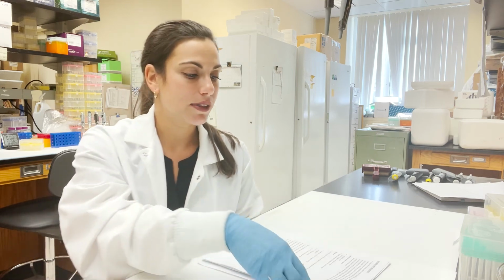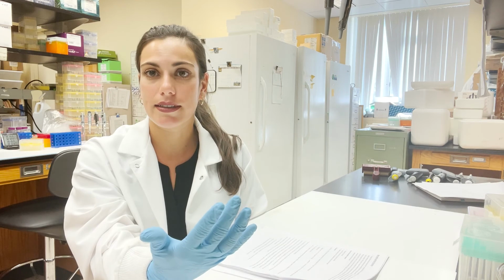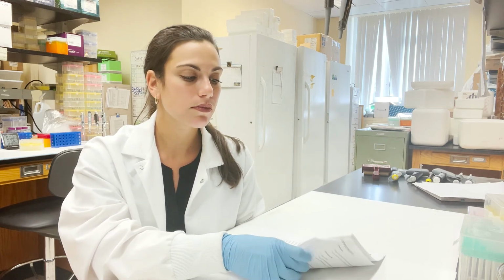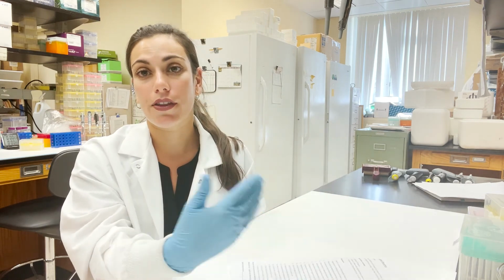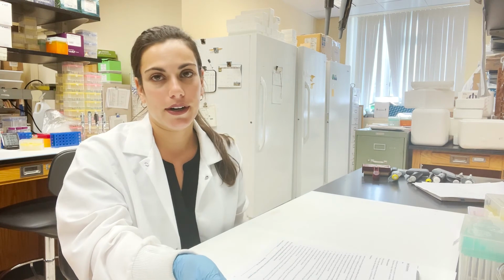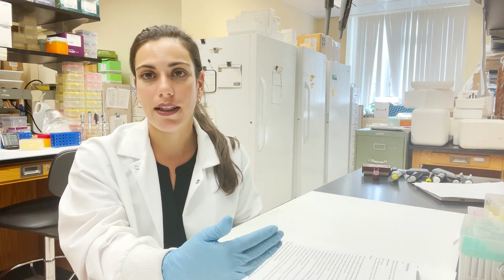And then what I would do is for all of those Eppendorf tubes at the end, which I will have 5 because I have over 200 samples, 48 in each, I will then do another cleanup step just to make sure everything is kosher, where we use the AMPure XP beads. And then we send it off to the sequencing company and they do a couple of validation tests.